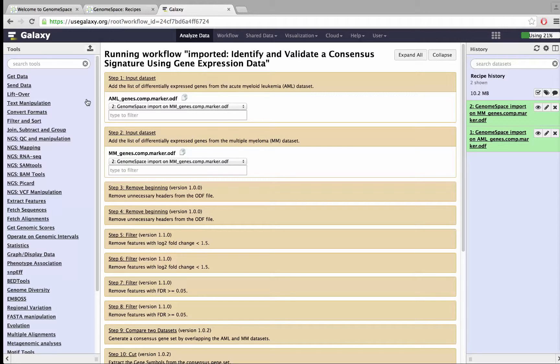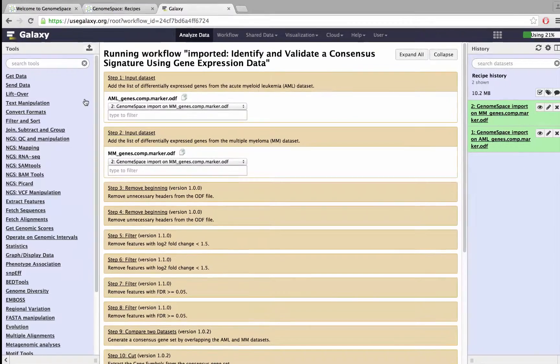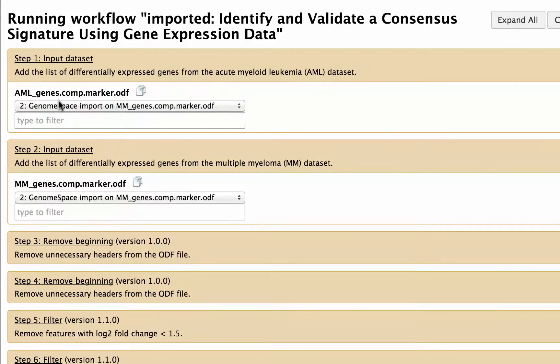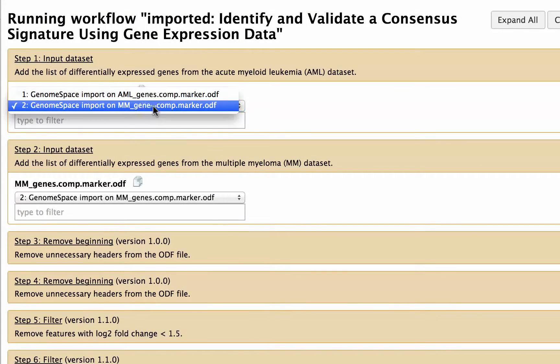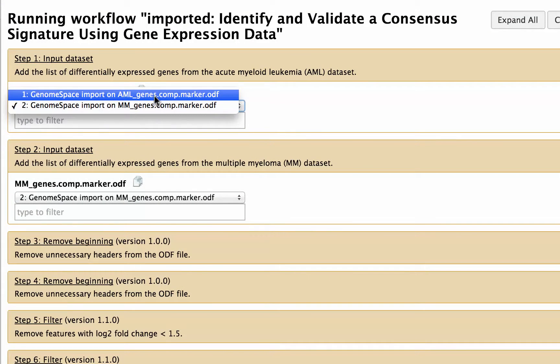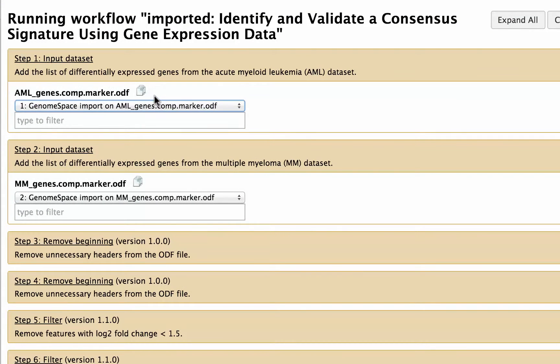For example, we set the first dataset to AMLGenesCompMarker.odf, and the second to MMGenesCompMarker.odf.